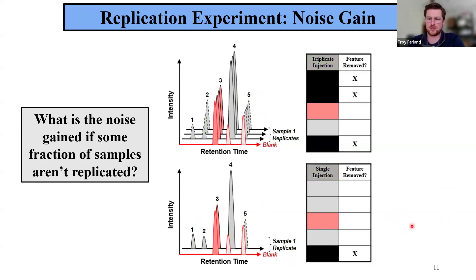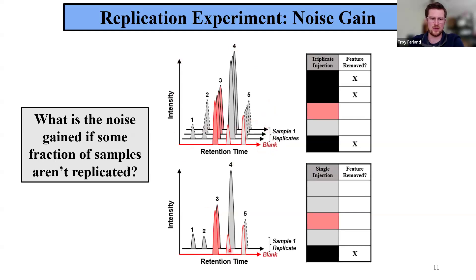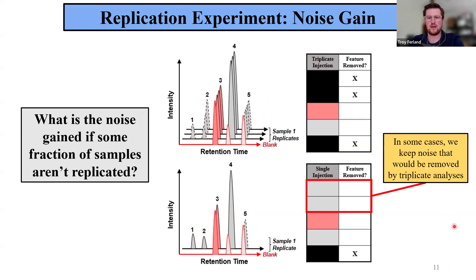Information loss isn't the only concern. In other cases, reducing sample replication can result in keeping occurrences and features that would have originally been removed. Looking back at sample one with only the first sample replicate, we no longer fail features one and two — originally removed because of replication and variance thresholds. When we reduce our replication, features one and two now exceed our threshold because we can't measure variance on a single point, and it's all or nothing for replication. So we would keep noise that would otherwise have been removed with the triplicate.